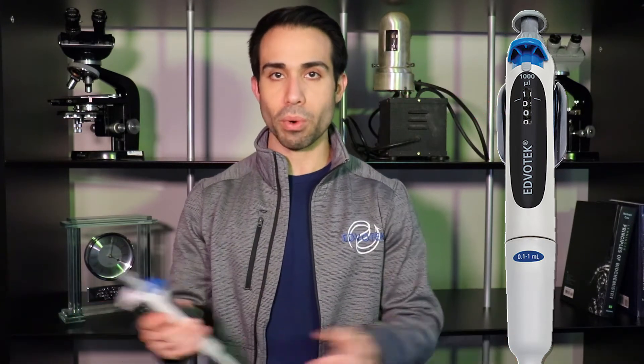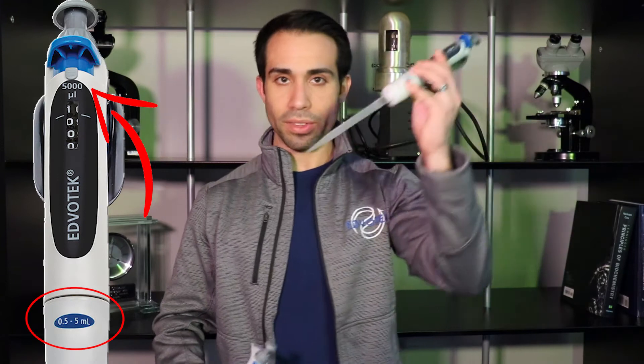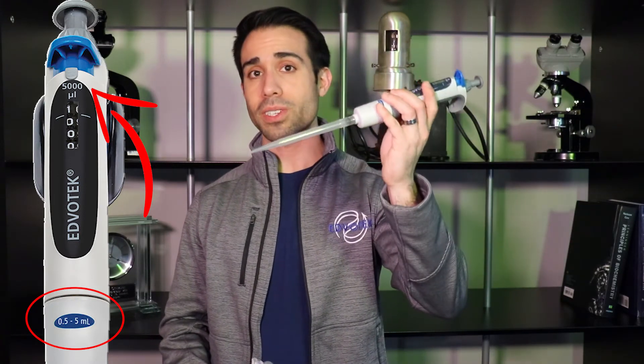Why is this important? Well, this allows you to specifically dial in the exact volume that you wish to move. This doesn't mean that one is good for everything, though — each one is going to be specialized. This one in particular can only go up to a thousand microliters, while this one can go from a thousand to five thousand.